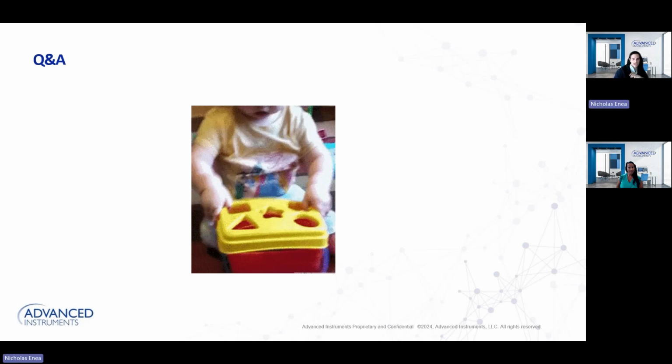Great. Jose, if a pipette needs to be adjusted because the minimum value is out of tolerance, where is the recommended adjustment? To the nominal volume or the minimum value? Great question. Candy, I'll let you take this one.